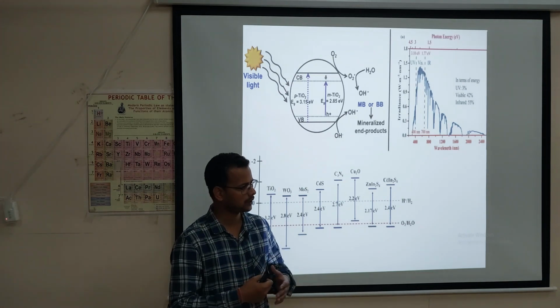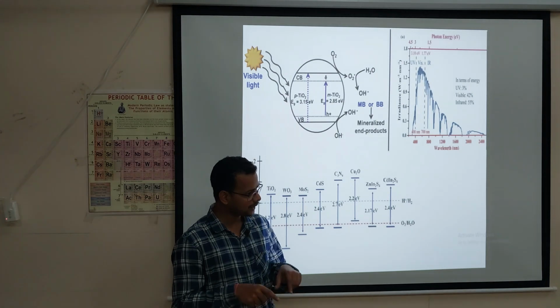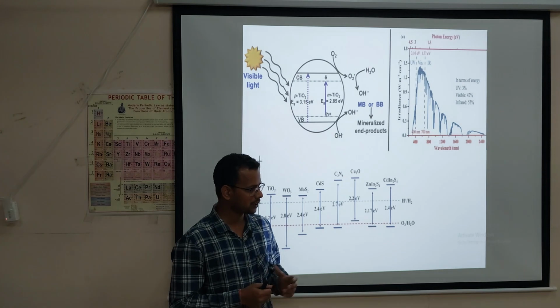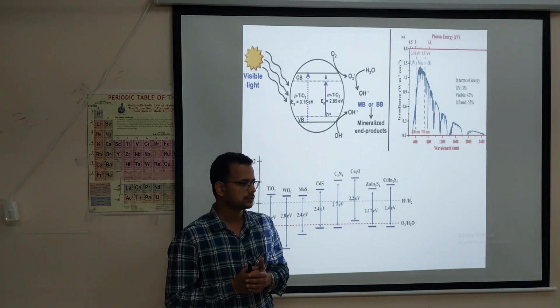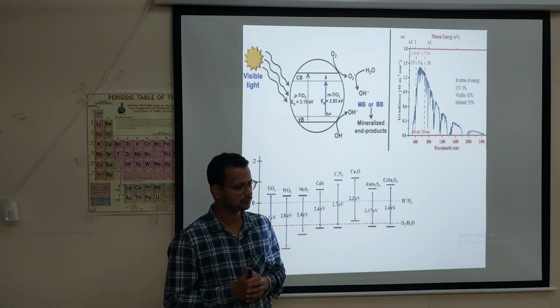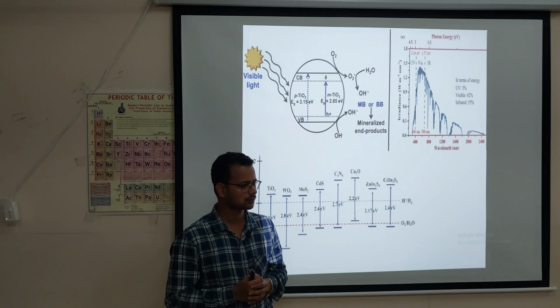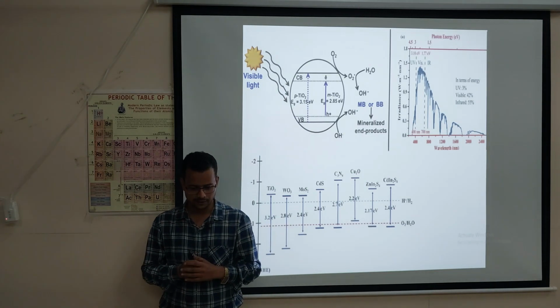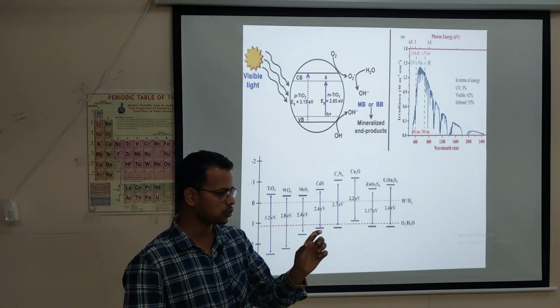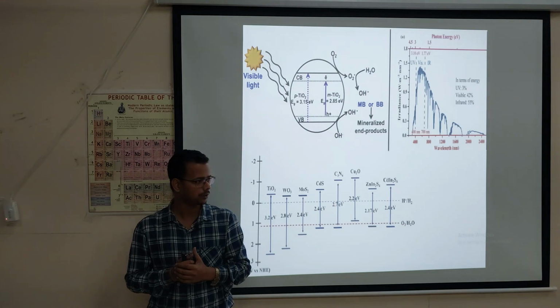Research is going on. It is not as easy as we are telling. Radiation must be efficient enough to cause the electron transition. Is IR radiation efficient enough to cause it? Just think about one thing: UV to visible is 200 to 800 nanometer.